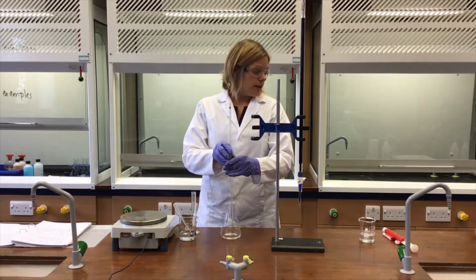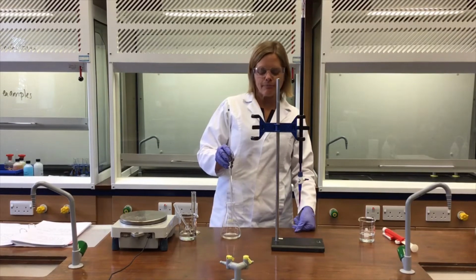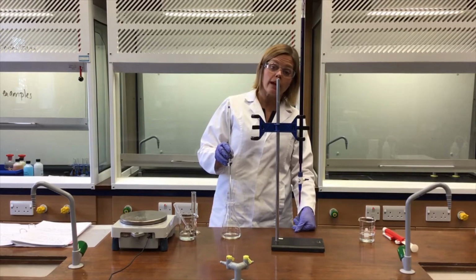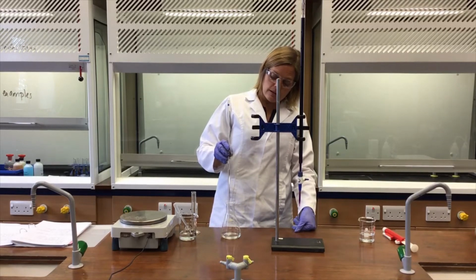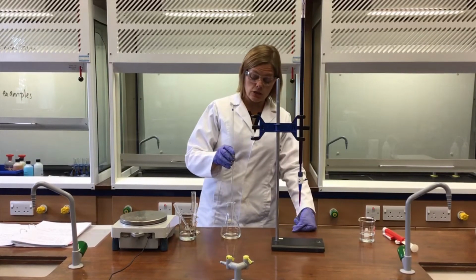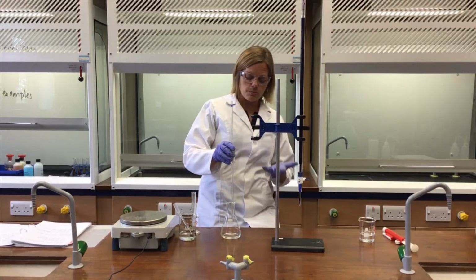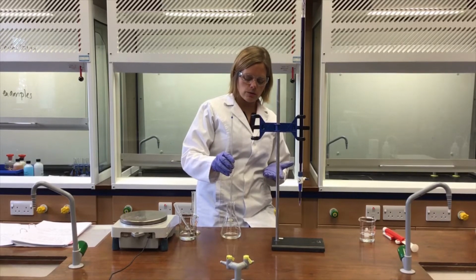and I'm going to make sure that I've got a water bottle to hand as well as usual in a titration, but unusually this time, once I've allowed this to drain into the conical flask, I'm going to add some dilute sulfuric acid to the conical flask. Now the dilute sulfuric acid does not need to be pipetted, and it does not need to be a particular concentration, because it's just there to provide H plus ions to drive that redox reaction in the correct way.